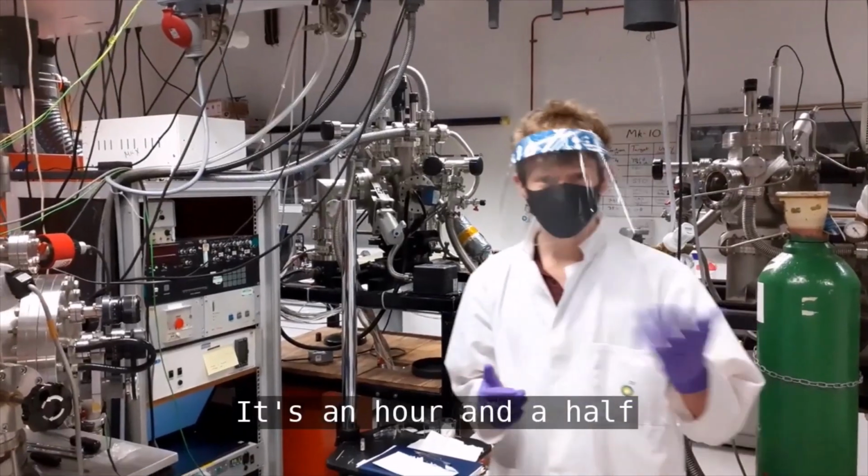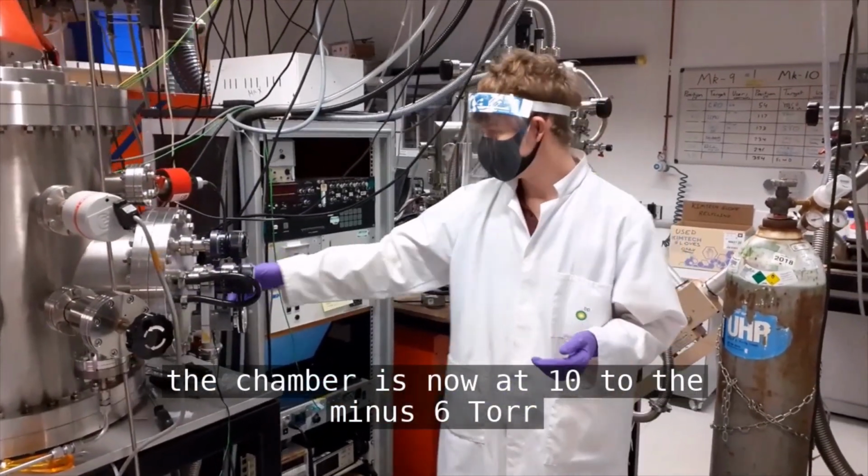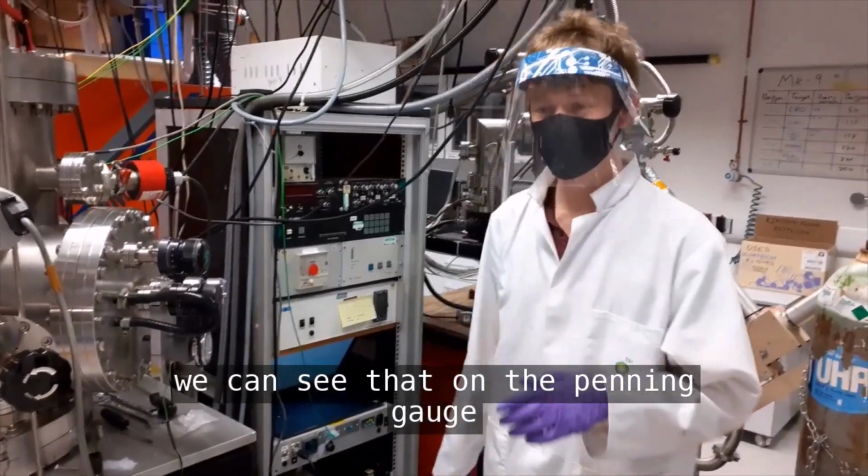Okay, so it's an hour and a half later. The chamber is now at 10 to the minus 6 torr, and we can see that from the Penning gauge here.